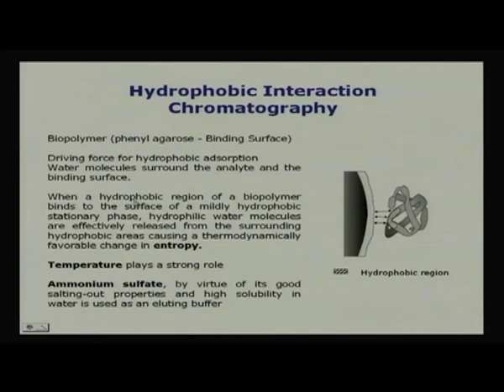When a hydrophobic region of a biopolymer binds to the surface of a mildly hydrophobic stationary phase, water molecules are effectively released from the surrounding hydrophobic areas, causing a thermodynamically favorable change in entropy, which is very important for this type of association.